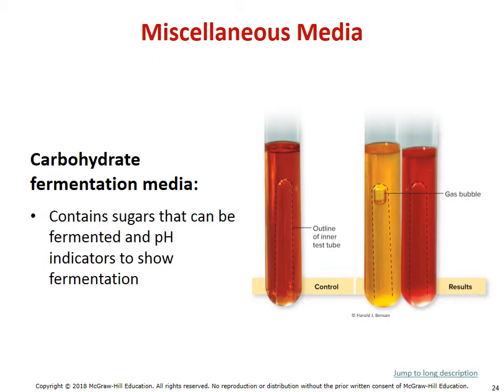Speaking of phenol red, the carbohydrate fermentation test also uses it. So notice again the default tube here is actually red because the pH is roughly neutral or normal, 7. And so the idea here though is if pH changes, it can turn to yellow. And again, that yellowing is really indicating a lowering in pH that we call an acid.